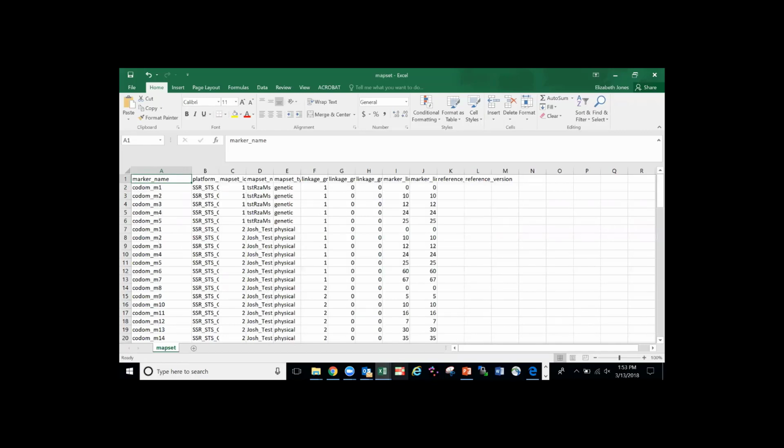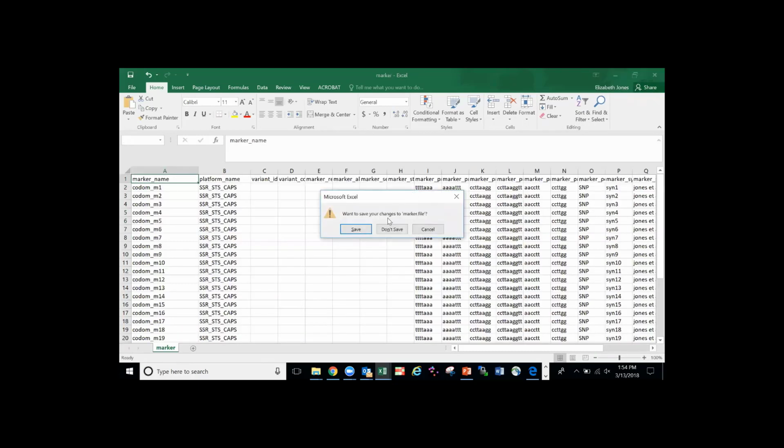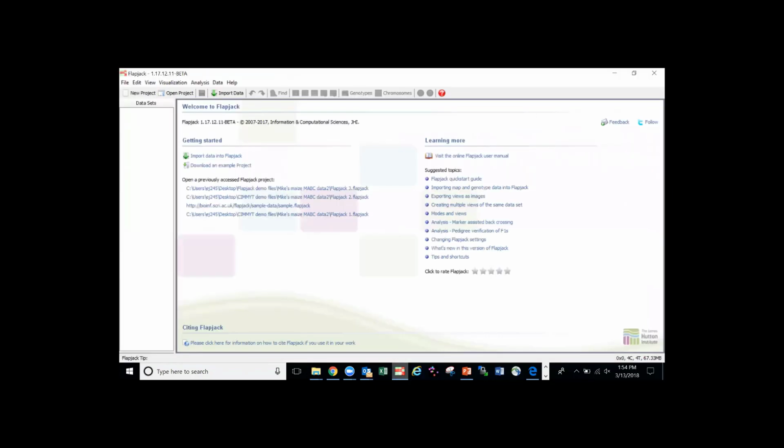Okay, so this little icon, I don't know whether you can all see, it's a little checkered icon, is opening Flapjack. Has everyone had a chance to open Flapjack yet? So all you do is click on this, and it will take a moment to load. But this is what you're going to see when you come into Flapjack. And Carlos will go through this again step by step. So if you can just watch for now, just to get an overview of what to do.